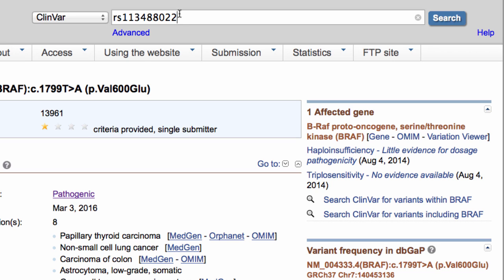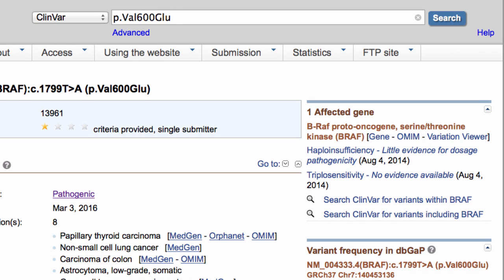Similarly, you can search for protein descriptions with a full HGVS expression, or with less specific terms, like just the p.Val600Glu, or even just V600E. But again, these may give you multiple results, because some protein changes can be caused by more than one nucleotide change, and well-known variants like V600E may be mentioned in summaries about other variants.